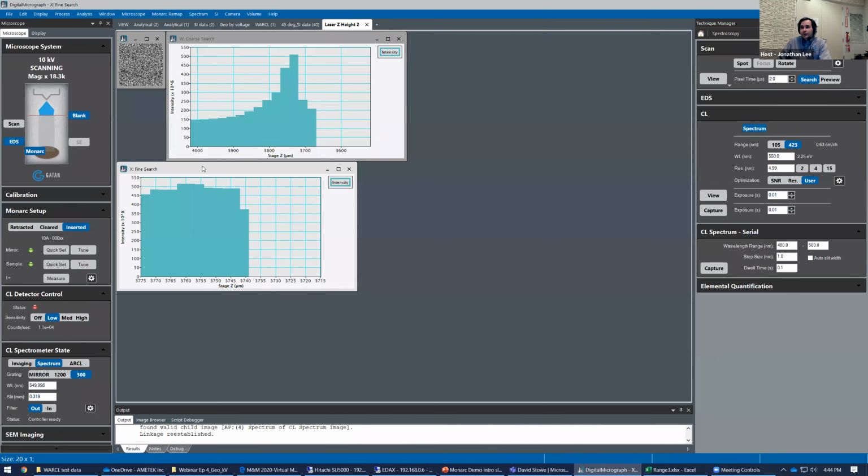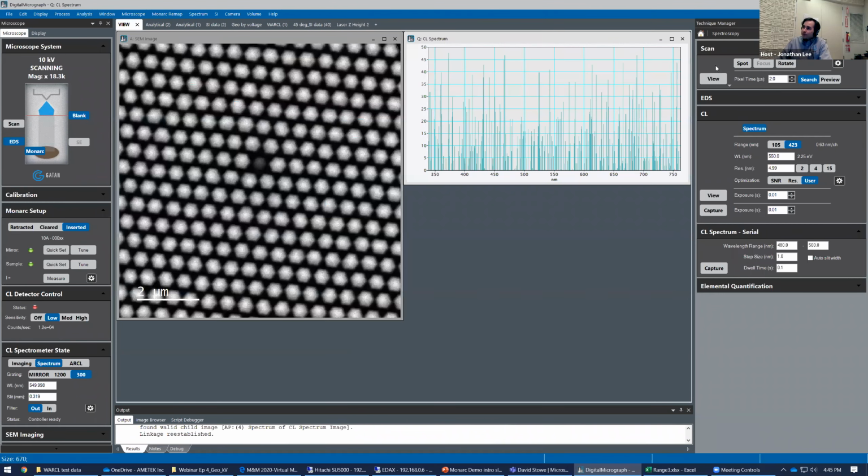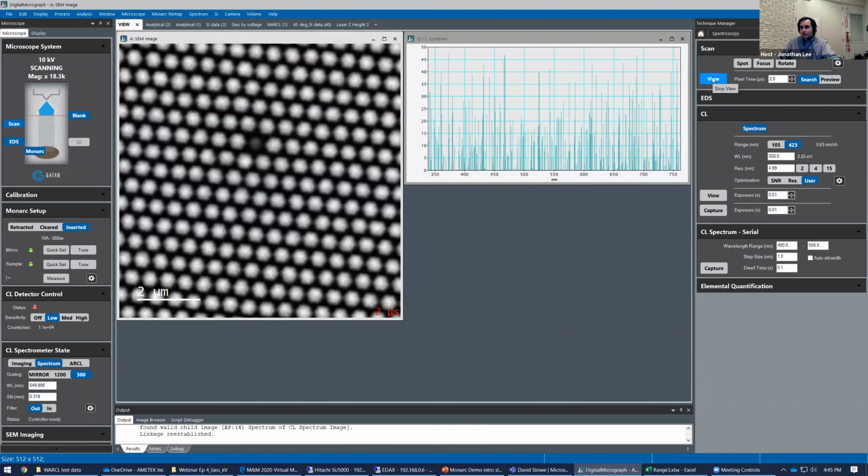All right, so this is an example of a successful surface. You can see the light intensity that coupled back into the system increased until it reached the maximum and then decreased thereafter. And then we did a fine scan to tune it a little bit further. So now that we're at the optimal height position, we'll refocus the microscope, something like here.